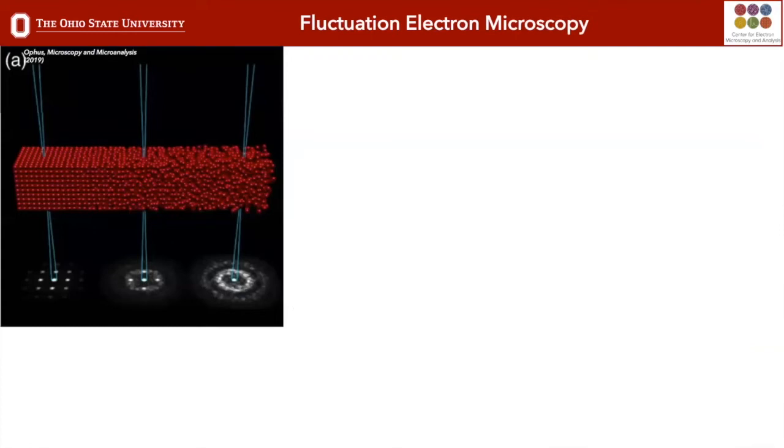Another aspect of both of these microscopes that can be a little frustrating sometimes if you're actually working on the microscope is that they have a C3 lens. And so again, if you've used TEMs, everyone should know about the C2 lens. It's the probe forming optic. In this microscope, we have an additional lens below that, the C3. And that gives you quite a bit of functionality and flexibility from an analytical standpoint.